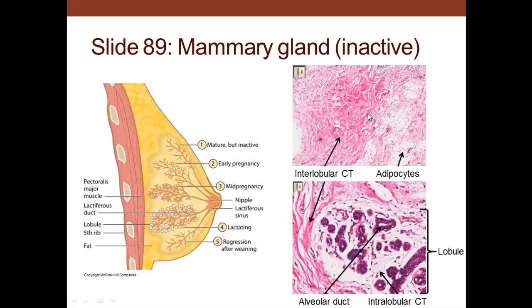This inactive mammary gland shows mostly connective tissue, but we can also see some of the alveoli and alveolar ducts. This is mature but inactive, so you mostly have just the ducts with little cells at the end. In early pregnancy you start to see some budding, and then in mid-pregnancy they are more elaborate, and at term the alveoli are fairly large, secreting the milk that will be released through the nipple.